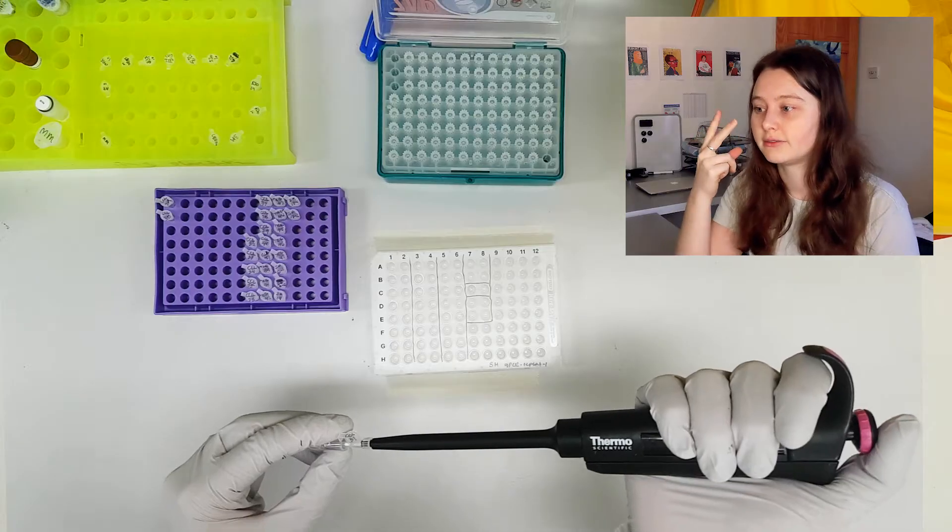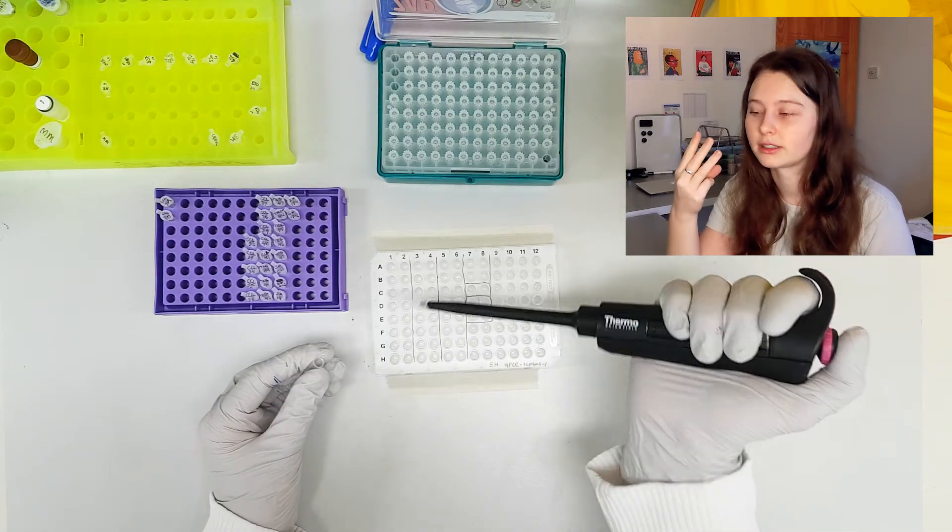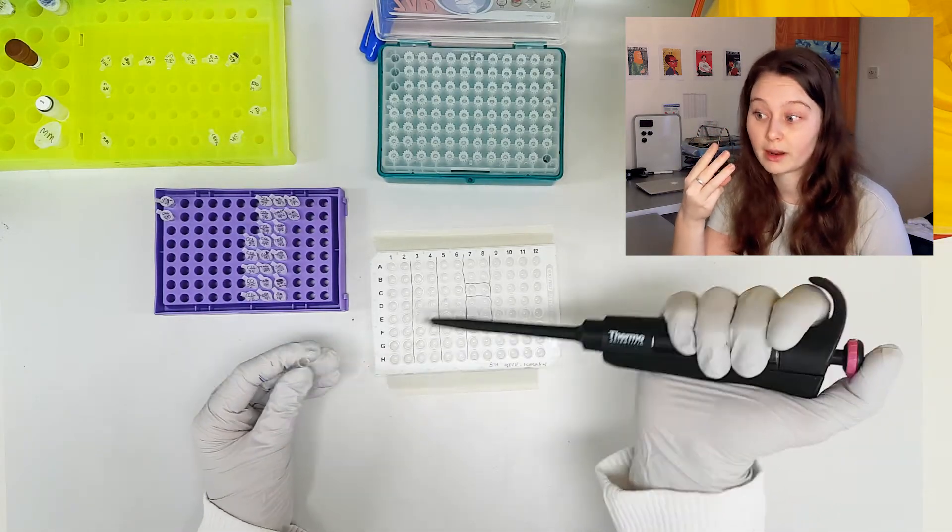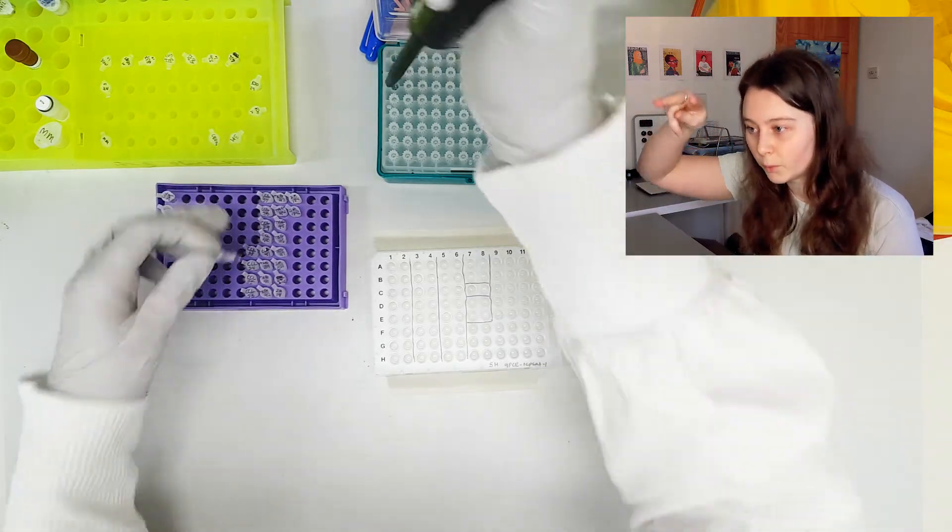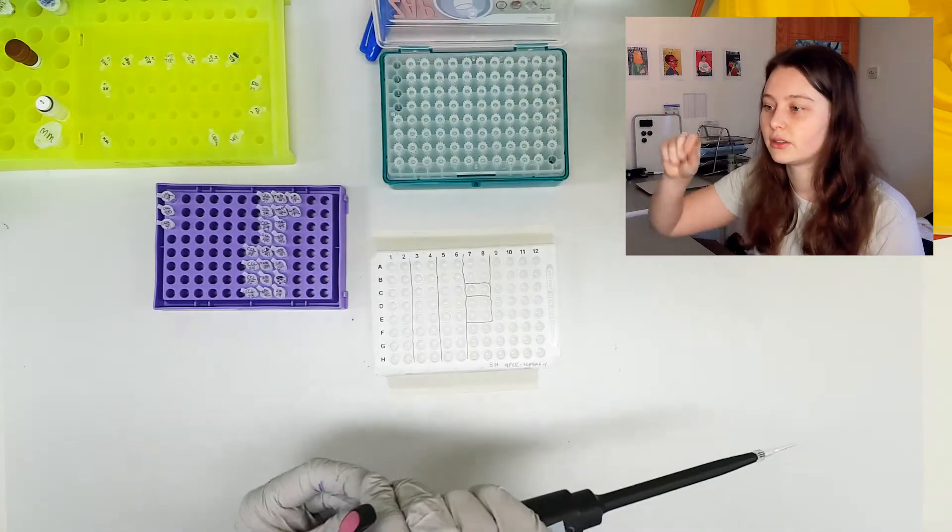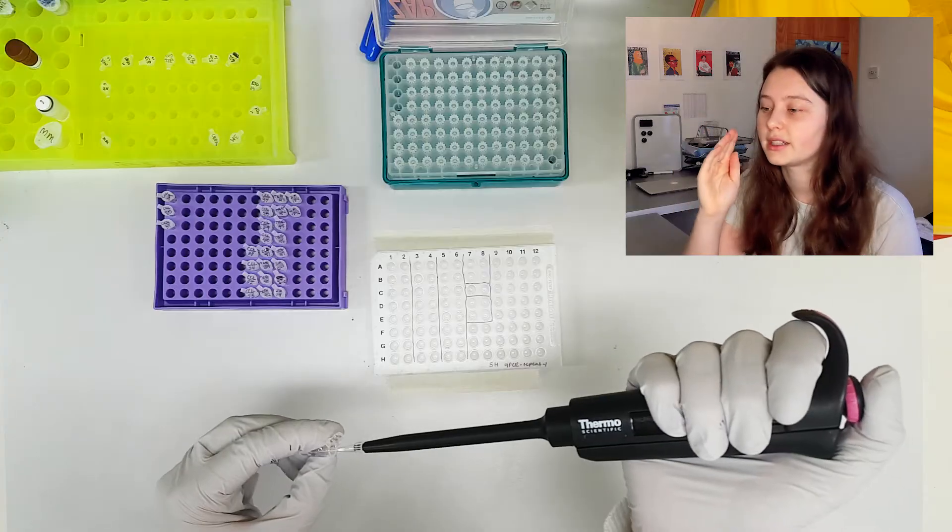So you can see I have two methods, or even three actually, of making sure it's going the right place. So the first one is that I've got that sharpie on the side of the wells to show where my samples are going in descending order, and the technical duplicates are by each other's side.